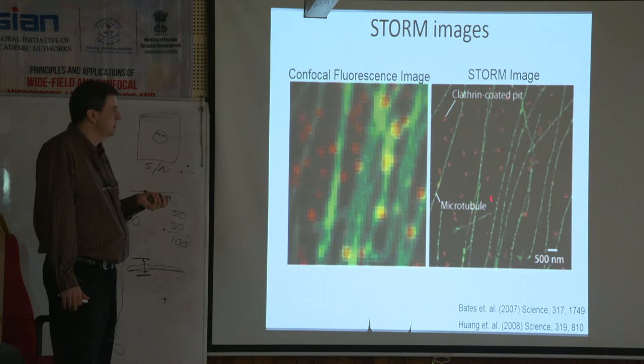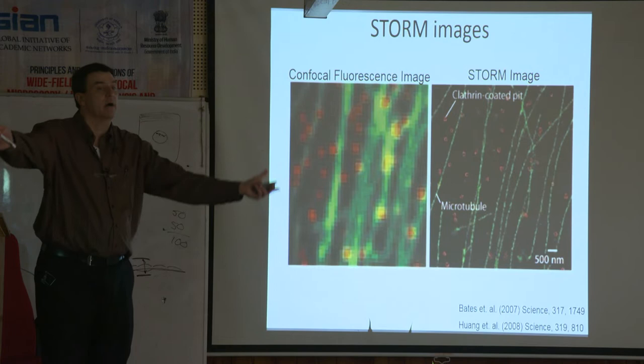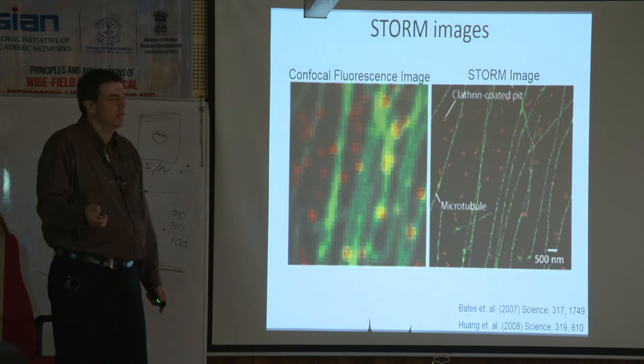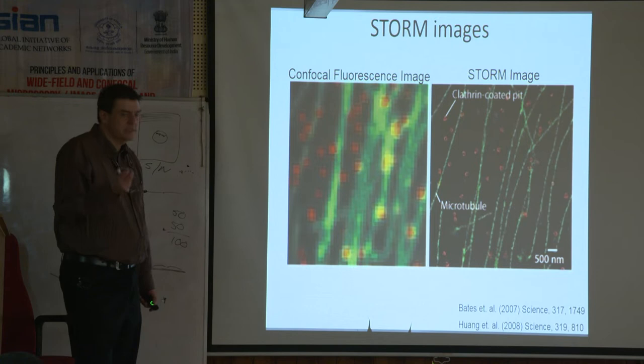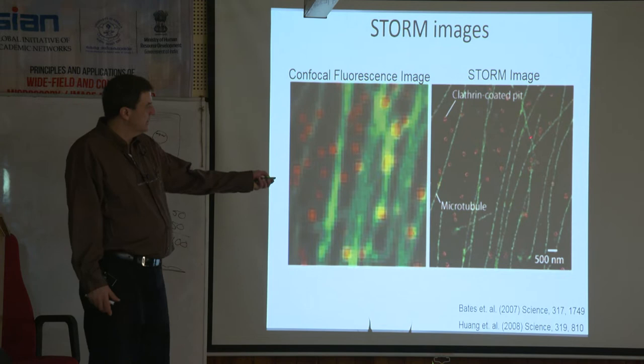Okay, let me ask a question here. With the optical microscope, we can get down to this kind of resolving power. What kind of microscope can give us even higher resolving power? We're going to be talking about it in a day or two, when somebody comes in to talk about it. Electron microscope, exactly. The electron microscope can give you even better resolving power, but the drawback is that the samples have to be dead. You can't do live. But the detail, I'm sure all of you have seen a picture of an electron micrograph, the resolution is just unbelievable. But again, you can't work in a living system. It's also much harder to tell things apart with an electron microscope. Here, we have all these techniques where you can label something green, label something red.